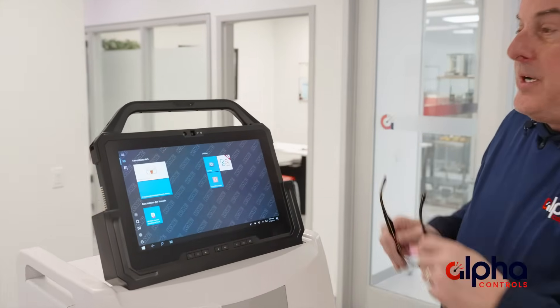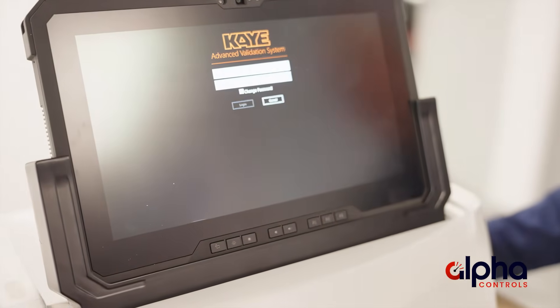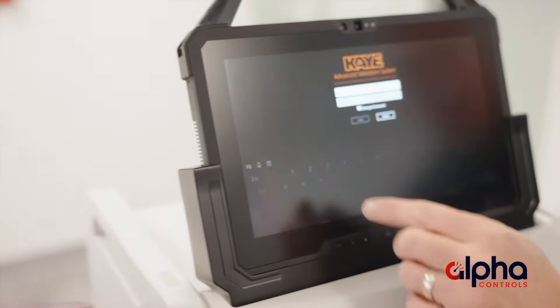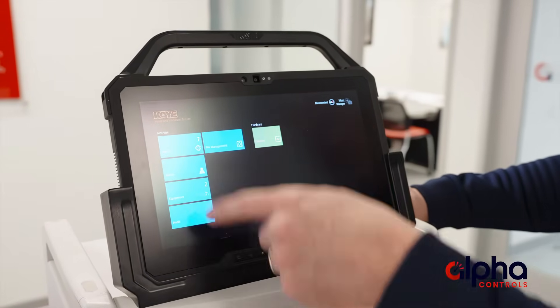Now that we know a little bit about the AVS hardware, let's take a look at the software. As you can see on the main screen here, we click on the AVS tab, which takes us into the main screen. You'll have to put your password in here, being CFR compliant. As you can see on the screen here, you've got all your different activities.